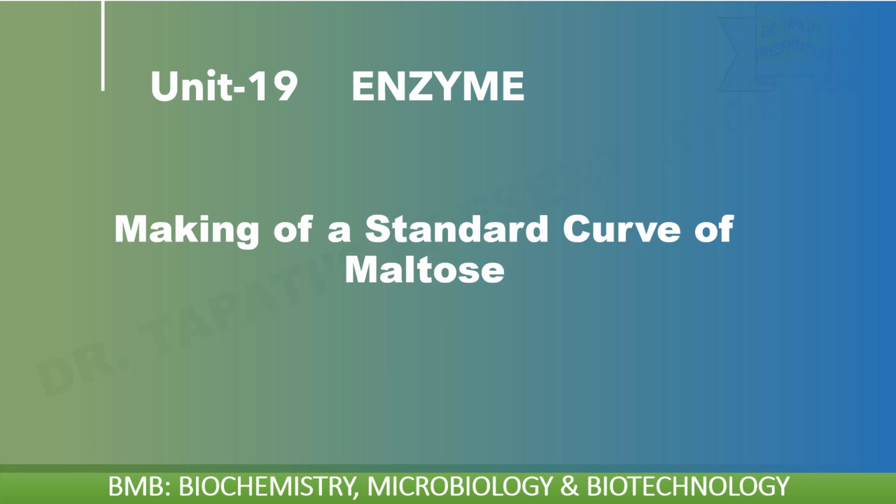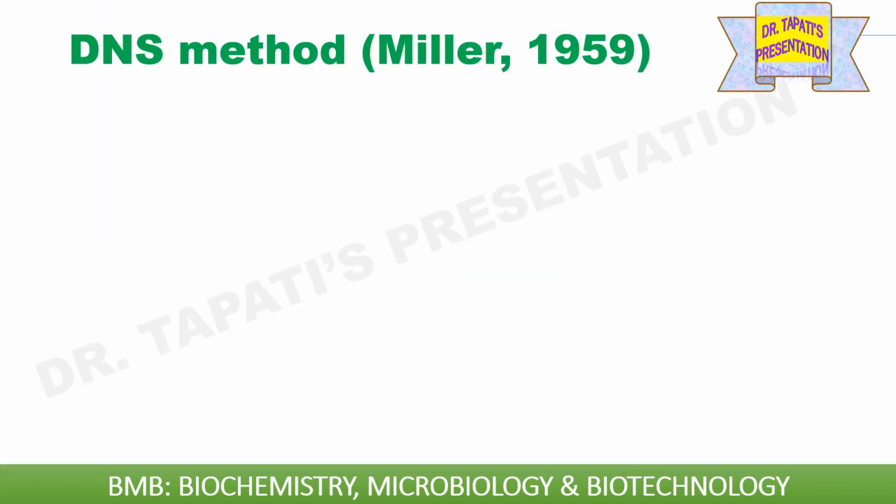Today in this video we will know about the experimental method to make standard curve of maltose. Standard curve of maltose is required to estimate alpha amylase activity. We are following DNS method to make standard curve of maltose.